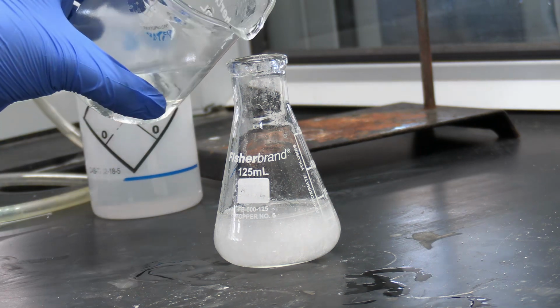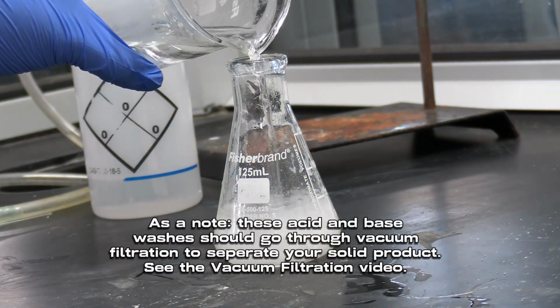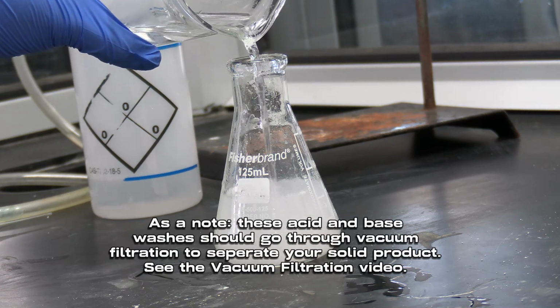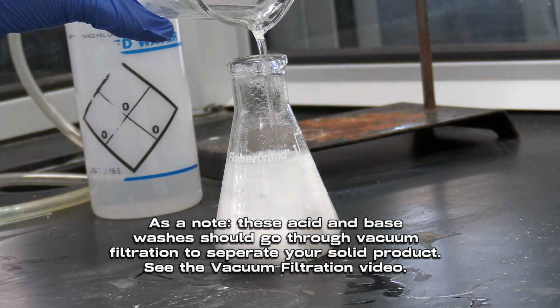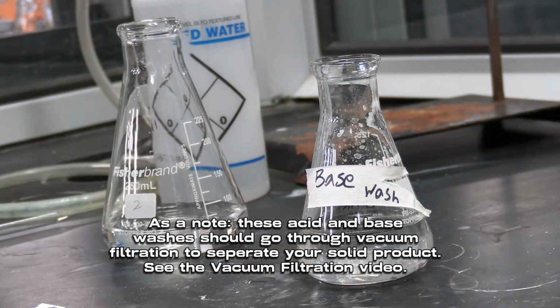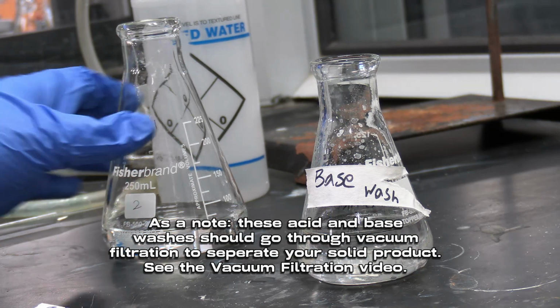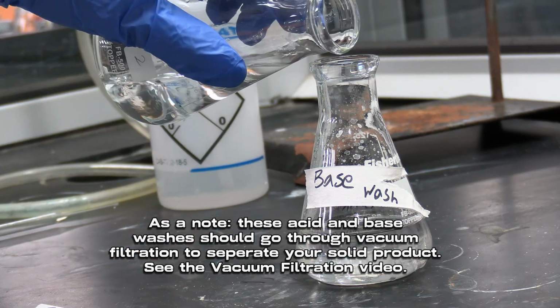Here's what it looks like when the solution is neutralized. You'll see it turns white, but most of the liquid inside of the flask is actually clear. The solid precipitate is the part that makes the solution white and will begin to solidify more once put in an ice bath. And here's the neutralization of the base wash. Again, benzoic acid is a white solid, so the solution turns white as the precipitate forms.